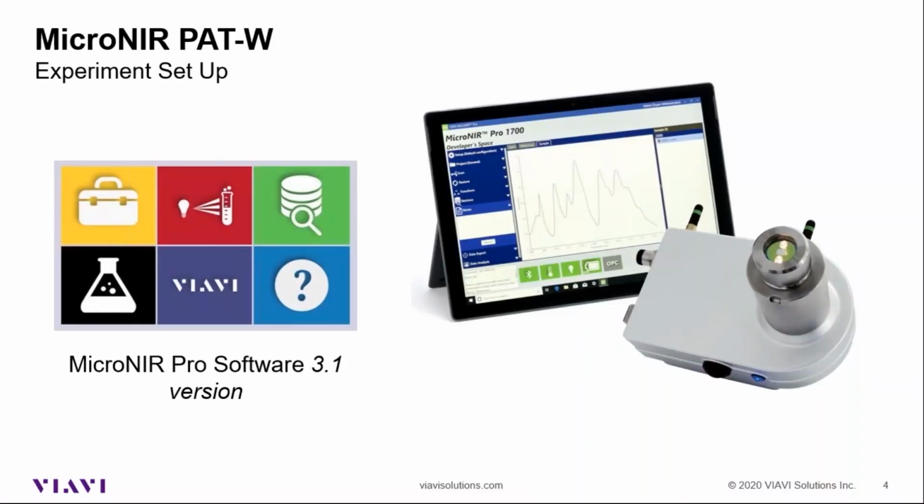If you remember, in the last weeks, I tried to acquire some samples together with you for both the raw material identification and the drying monitoring. But today was too hard to have here at home with me a big blender full of powder and API. So unfortunately, imagine that I already acquired my spectra.